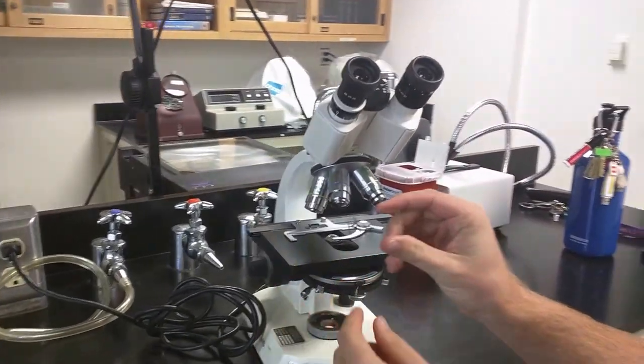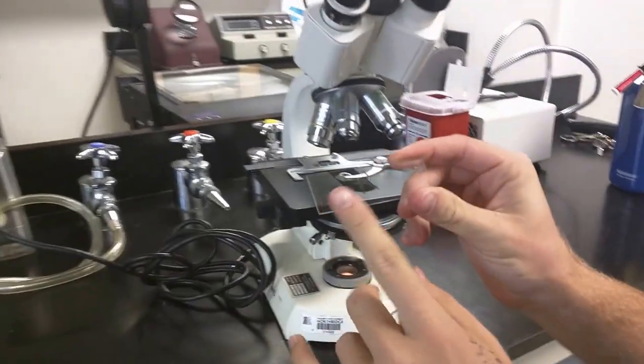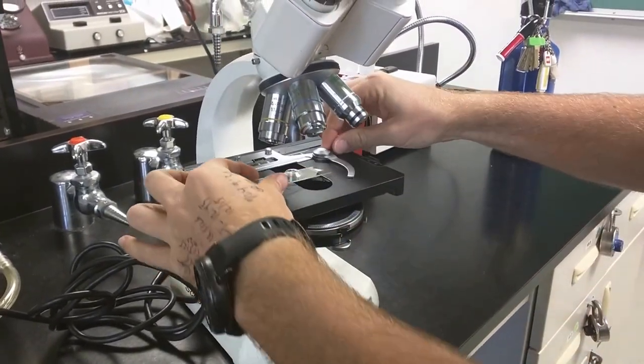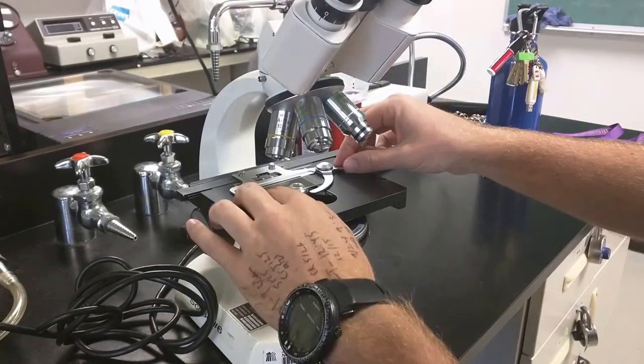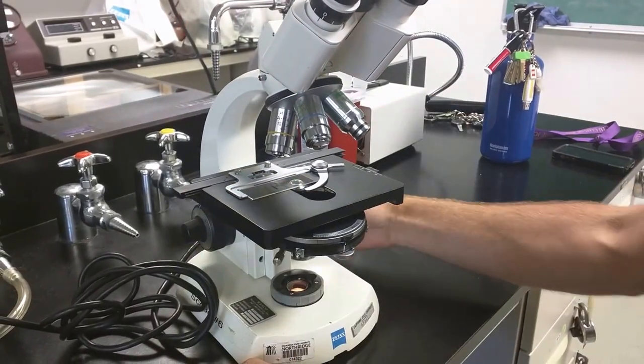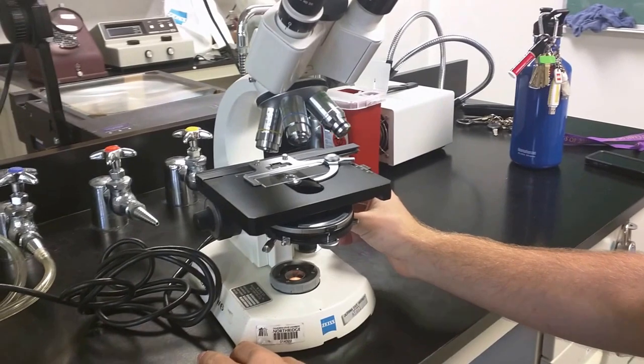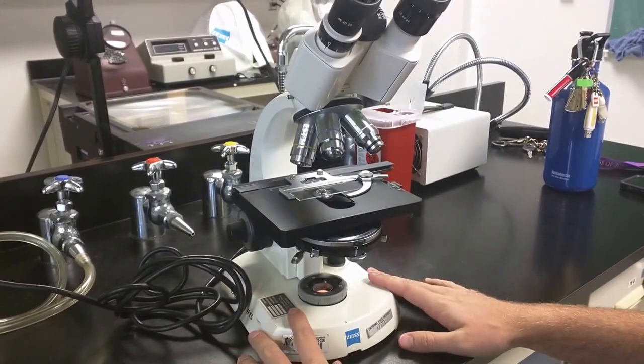I've got a slide here with an R on it. This is going to be my test slide to focus on to line the scope up. So I'm just going to slip it right in here making sure it's securely locked in place. Move it to the center. So I'm looking at the R that I wrote on it.